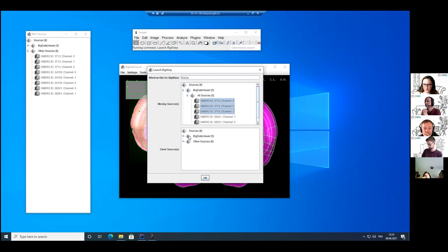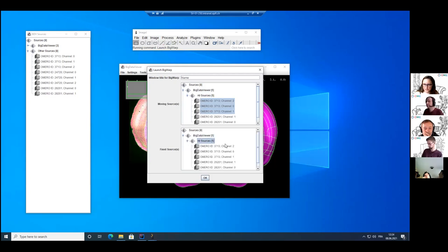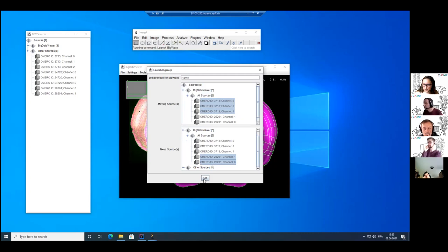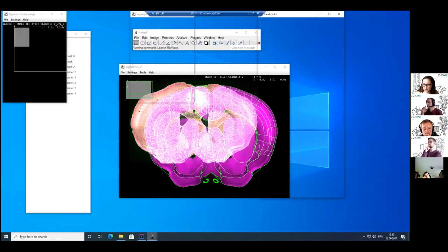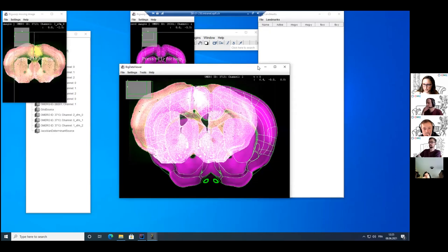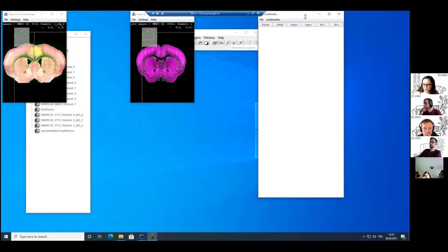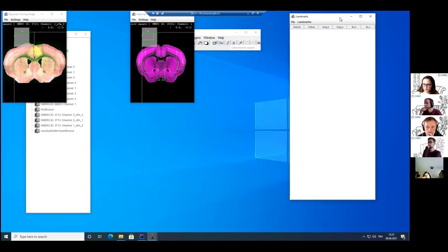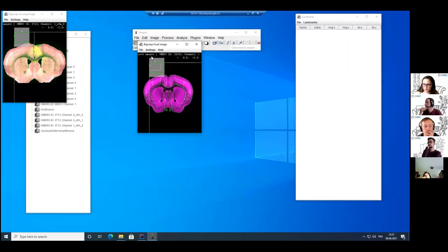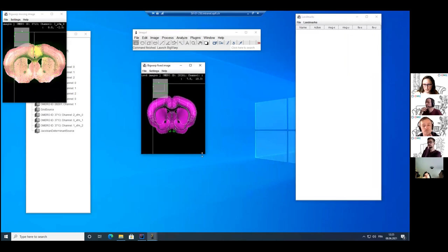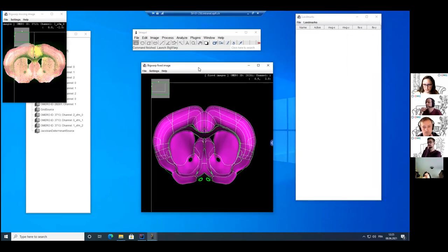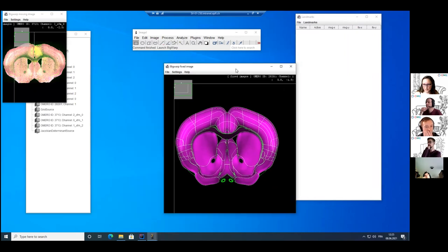And as fixed sources, I will select the brain slide from the Atlas. So the two channels corresponding to this image. So let's select okay. And now I can minimize this window and I have the two different images opened with BigWarp.